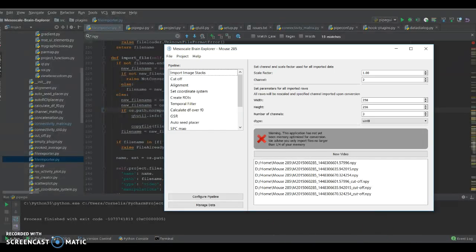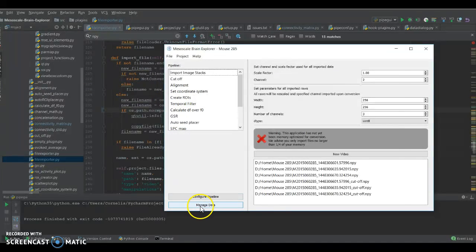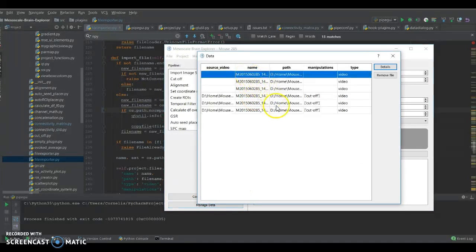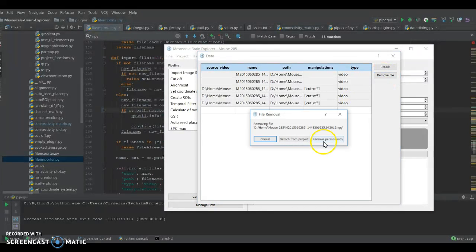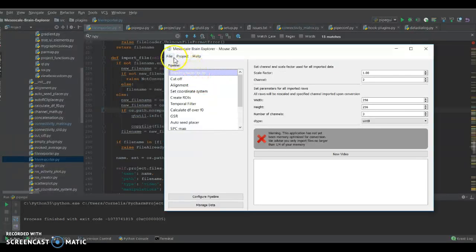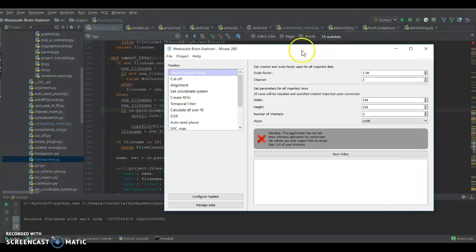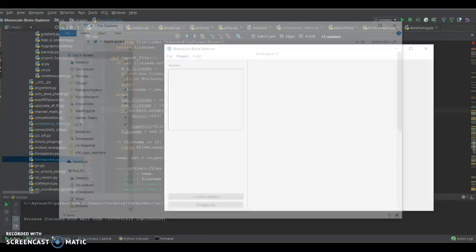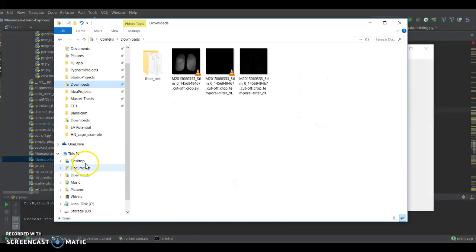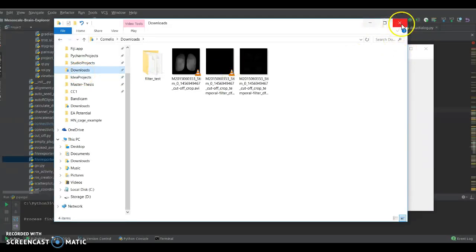Anyway, let's get started. So first things first, I will quickly just clean this up. Okay, I deleted the files that were there from the previous project. I could actually also just have done, let's close this, and yeah. Okay, fine. I'm happy with that.